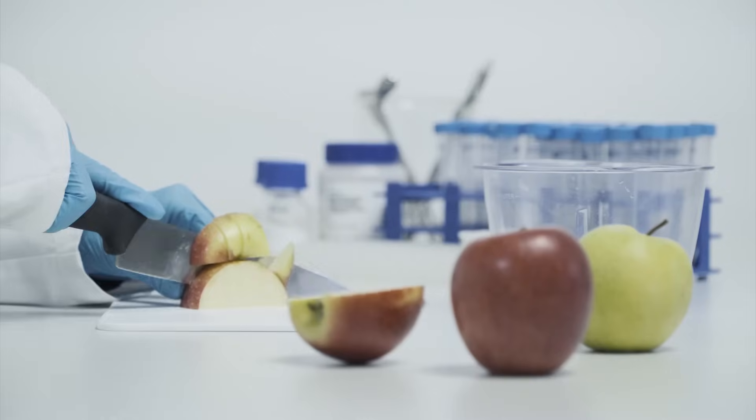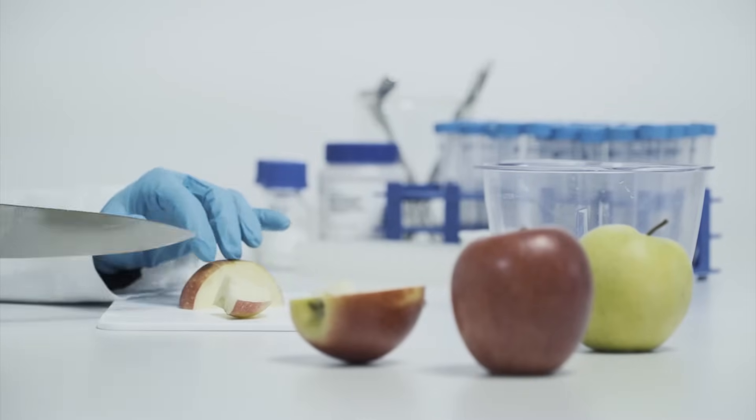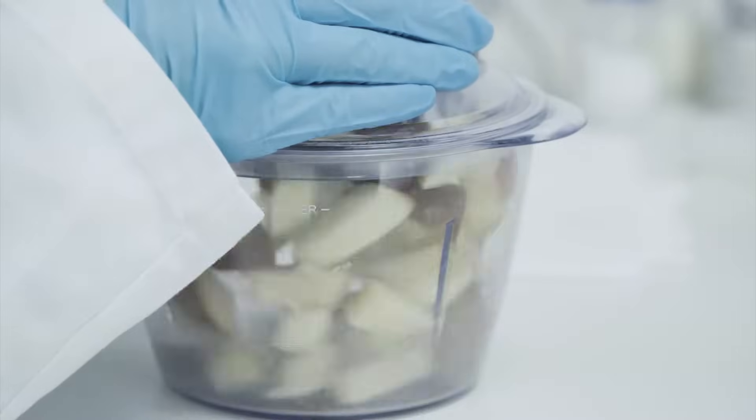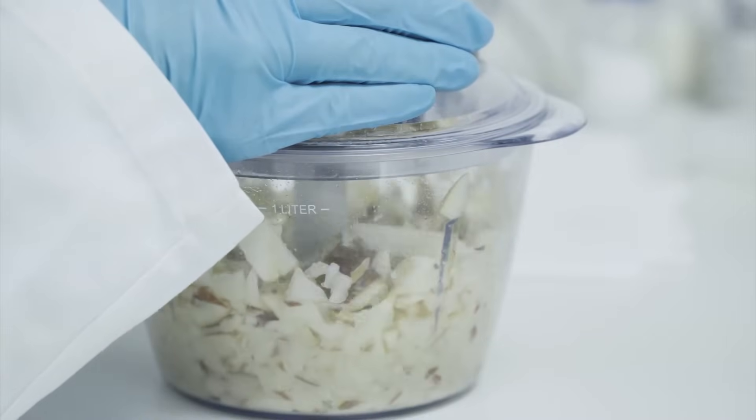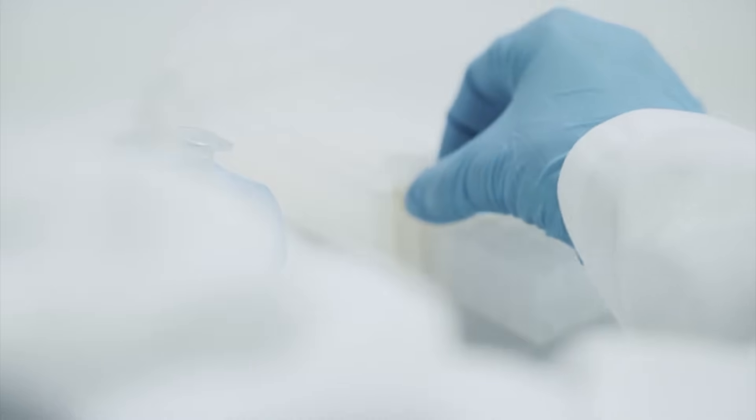To prepare such calibration standard solutions, high purity pesticide reference standards are used to create stock solutions which are then diluted and combined according to the required analysis.